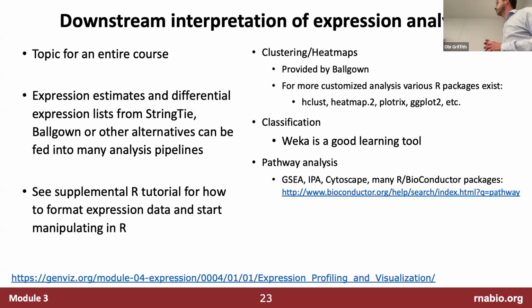Downstream interpretation of expression analysis could itself be a whole course. We're going to do many of these things. We can take expression estimates and differential expression, create visualizations, and put them into downstream pipelines to make heat maps, do clustering, potentially do classification, do pathway analysis, and more.